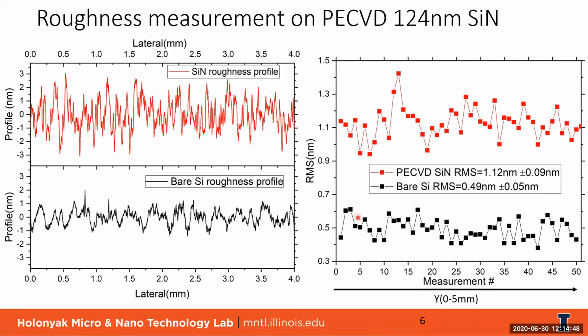Again, the red data point, we repeat 50 times using the same fraction that we move every 100 micron, every scan, we then move 100 micron in the Y direction. And again, this axis represents the Y direction of the wafer.